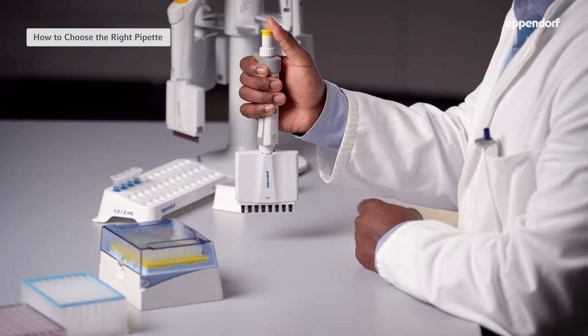This pipette, for example, is fully autoclavable and can easily be taken apart for cleaning.